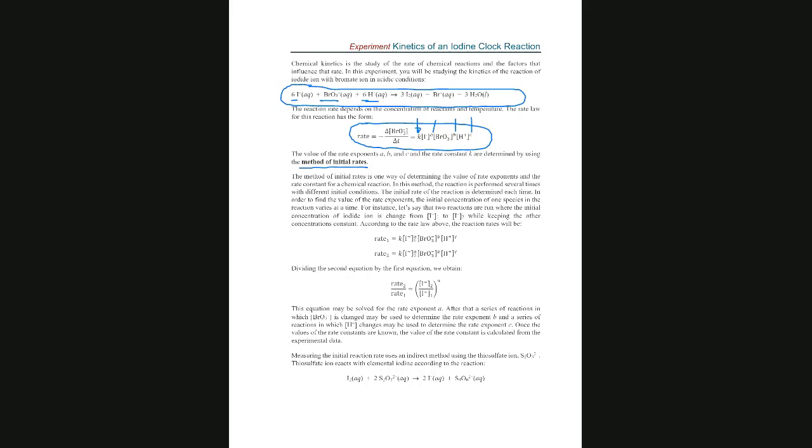Let's move and we are going to see examples. For example, here they are showing. We are going to run a reaction, we are going to measure one rate here, and when they write here, they say, okay, this is the rate law for this specific run.